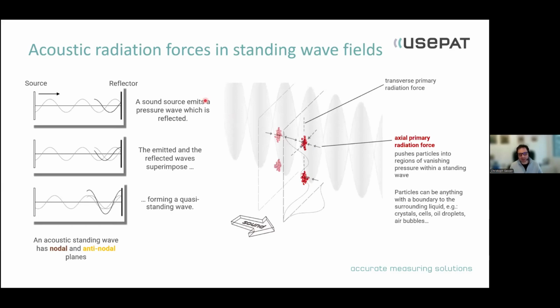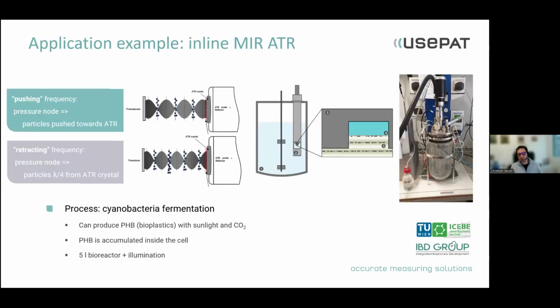Now, a quick couple of words about the physics behind it. If you're using a standing wave field, and a particle enters such an ultrasonic standing wave field, it gets subjected to radiation forces, and those radiation forces force the particles into certain regions. Particles for us is everything that has a boundary to the liquid. So it can be cells, crystals, oil droplets, it can even be air bubbles.